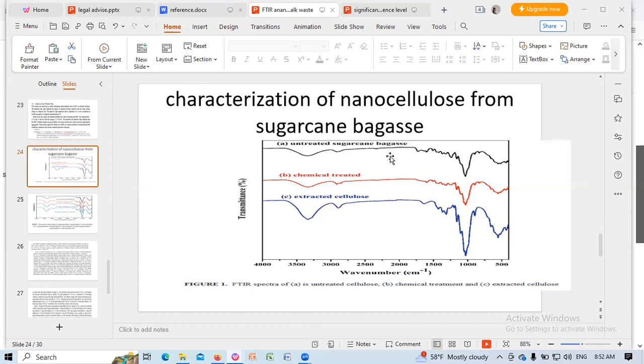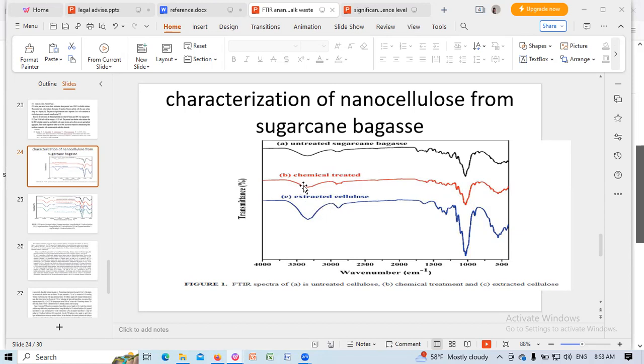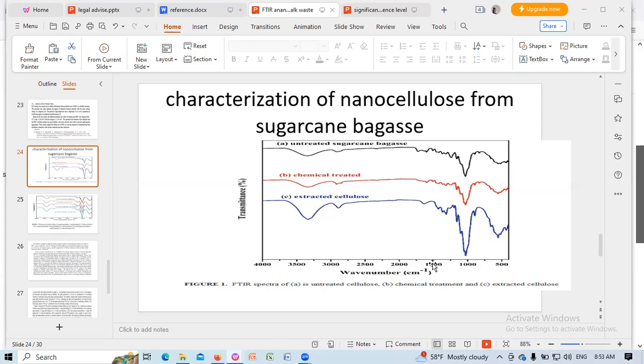This is the FTIR peak of cellulose. We see the peak in the around 3000 per cm and 2900 per cm. Similarly, in the range of 500 to 700, we are seeing the peaks.